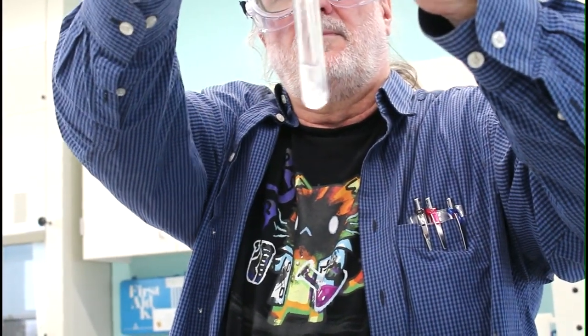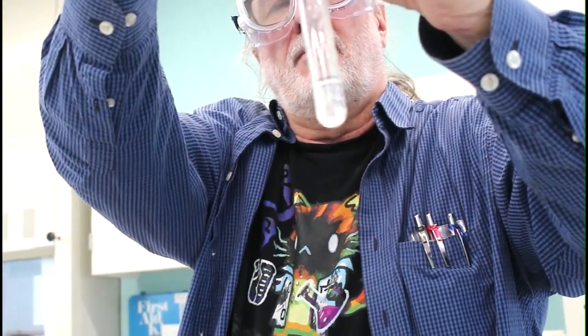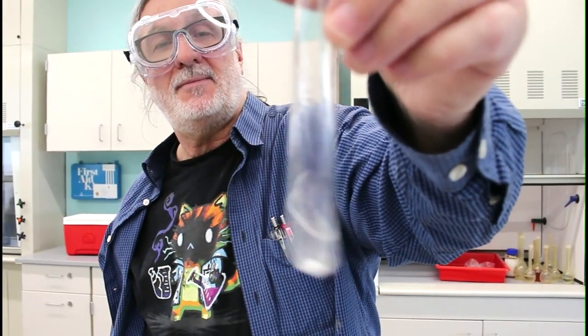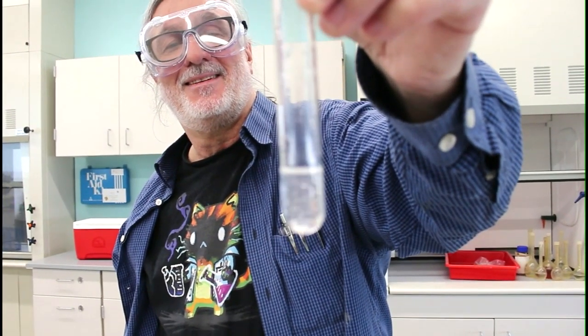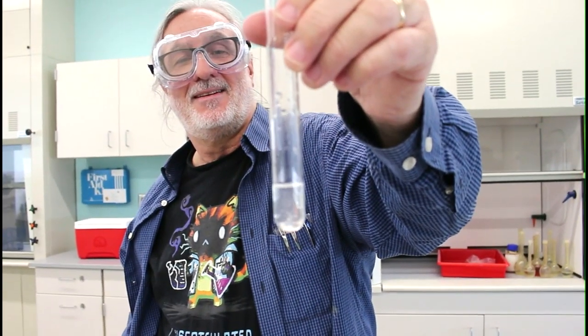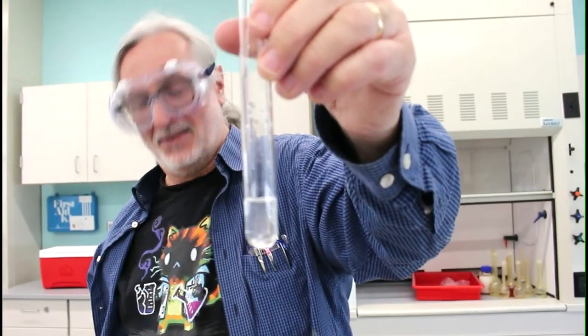Ooh. Can you tell anything? I can. Boy, that ammonia smells funky. Can y'all smell that? Stop stirring it. It's not picking up. Looks a lot clearer to me. It's kind of clumped there on the bottom.